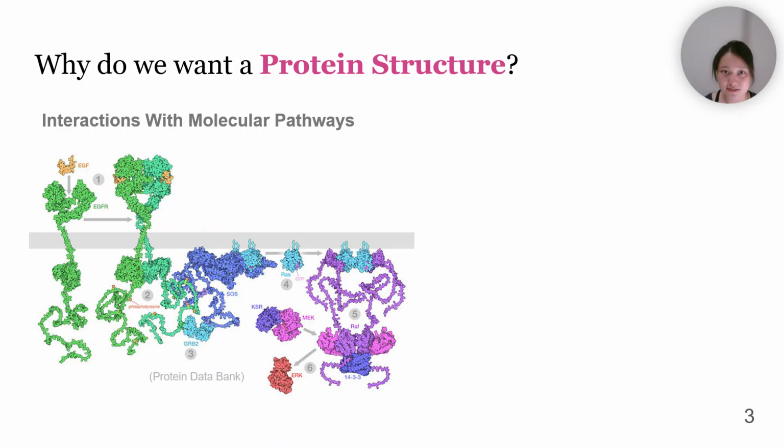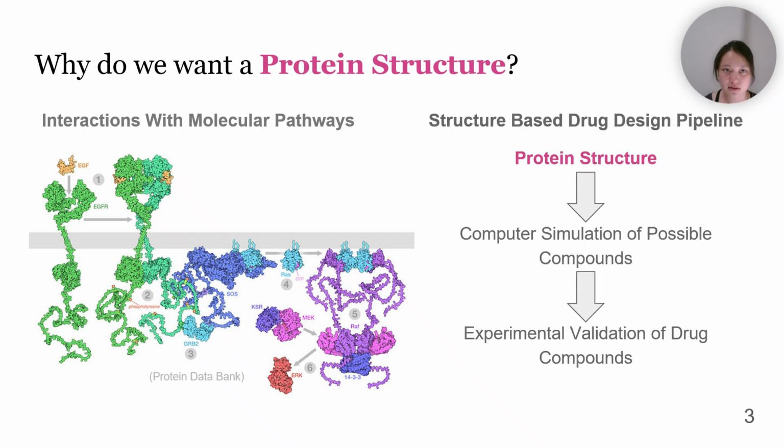Such information is of clinical significance, as it 1. gives insight into how the protein interacts in key molecular pathways, and 2. allows us to design therapeutic drugs in a process called structure-based drug design.